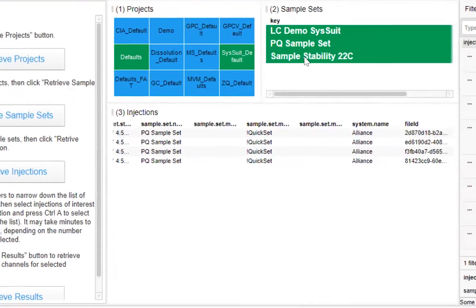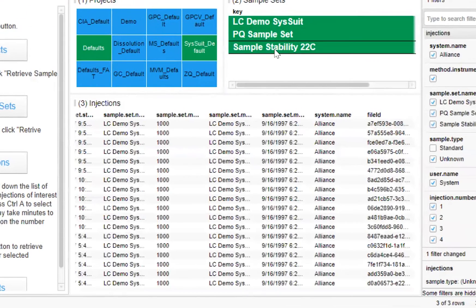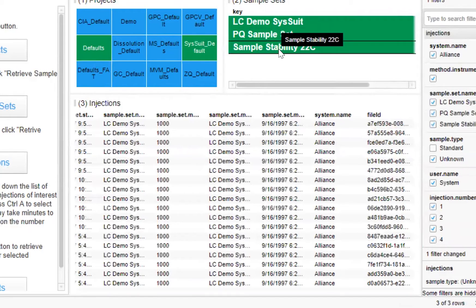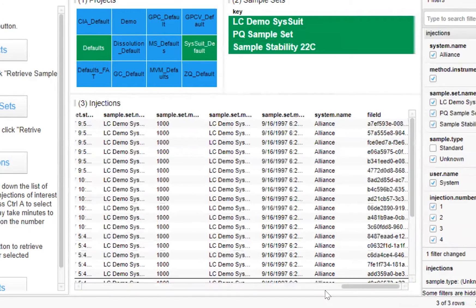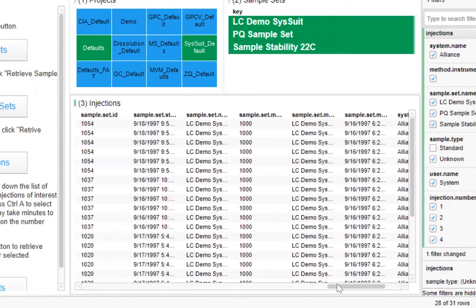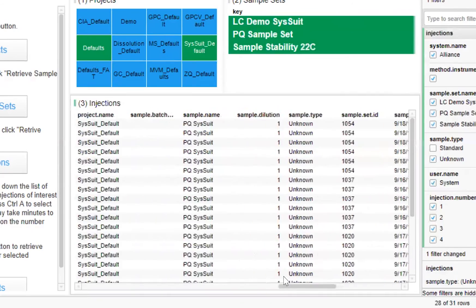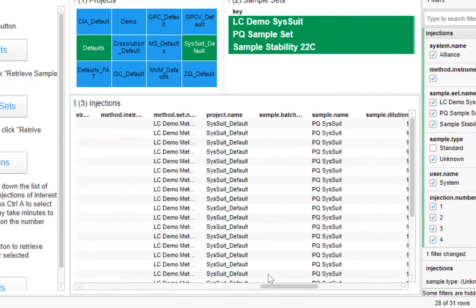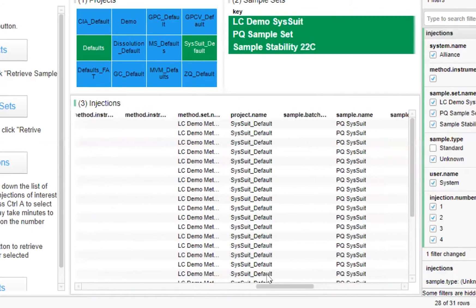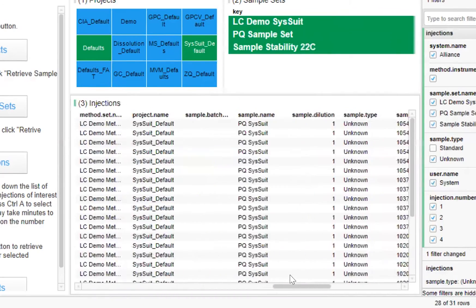As we can see, data is retrieved immediately from the TetraScience data lake. We can explore the metadata associated with each injection, including its ID, when it was taken, and the sample set's method.